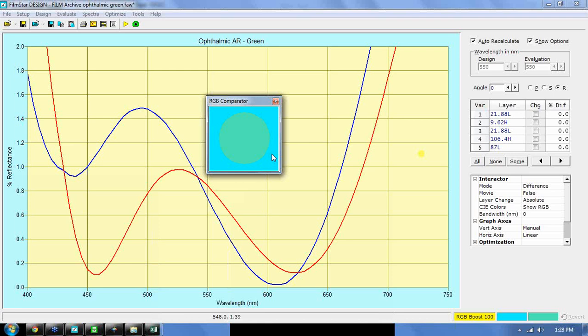We all know that when coating eyeglasses, most lenses that are dipped CR39 all come out the same color. But when we have polycarbonate that are spin coated, when we have high index lenses, 1.74 plastic, and we dip that and then AR coat it, it's a little bit brighter of a color. It's a different color. And we can go in here and actually measure using the HunterLab a CR39 lens that has gone through the process and a 1.74 or a polycarbonate lens that has gone through the process. And we can actually see those two different colors and adjust for it if we want to.